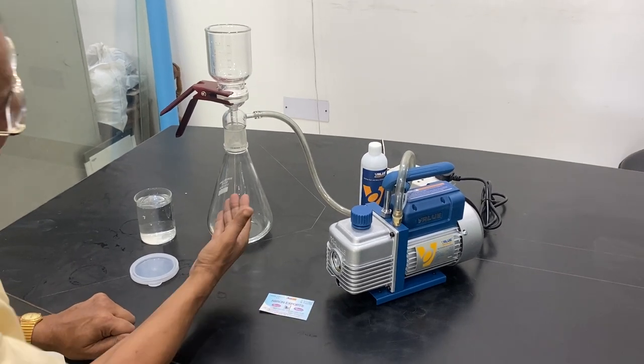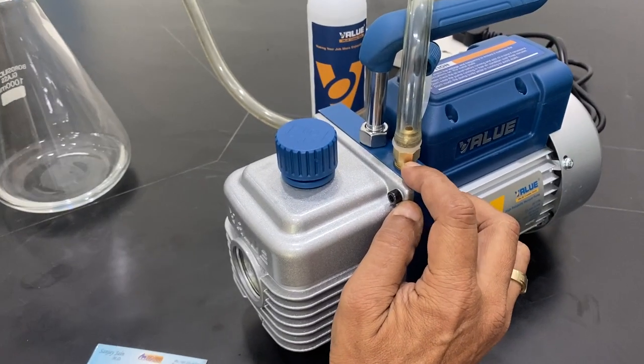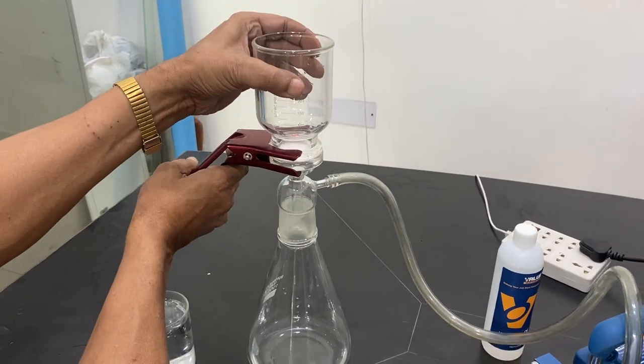Today I will tell you how to do the mini core filtration setup and attach it to the vacuum pump. This is a pump where it takes the air inside, so it is to be attached. A rubber tube is to be attached to this point, and there is a porous disc plate — you have to open it.